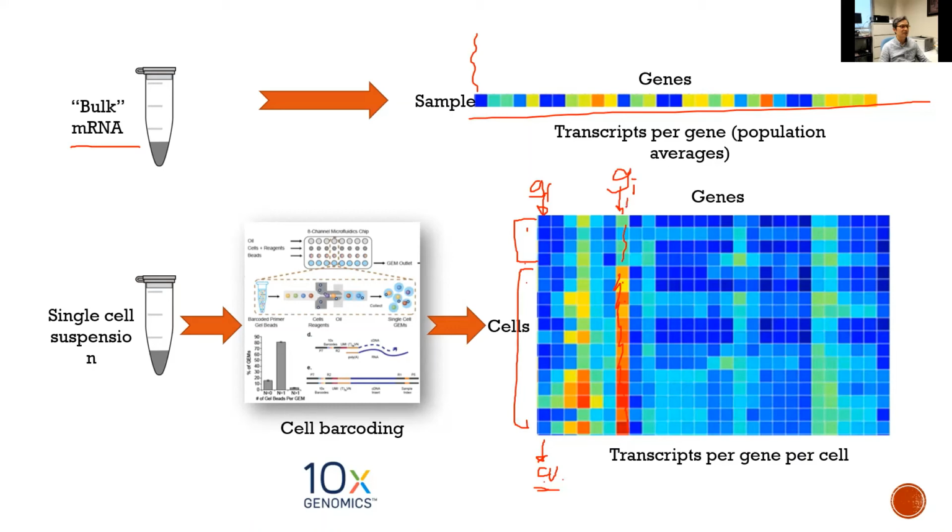So this column is more important biologically compared to this column, where, for example, there is no gene expression at all. Feature selection will help you select those kinds of genes and delete some of the less informative genes to reduce the dimension and use these highly meaningful genes to do the downstream analysis. That's one purpose of feature selection of highly variable genes, because they tell you the difference between cells.